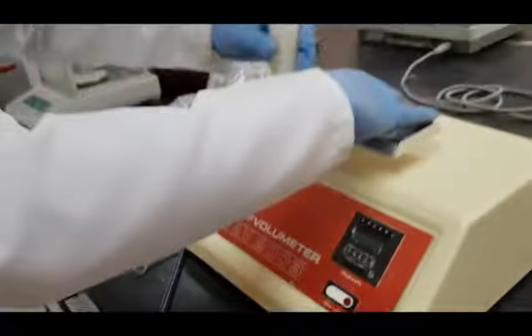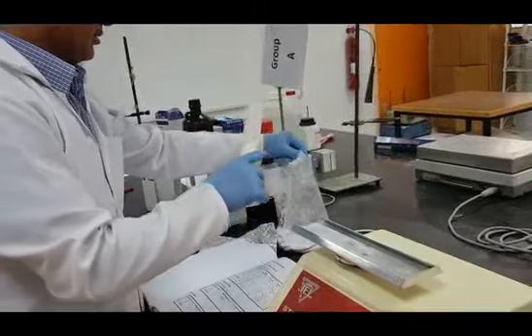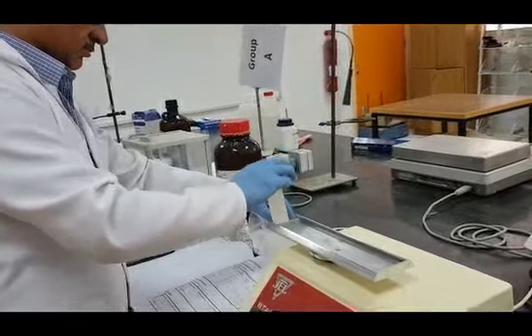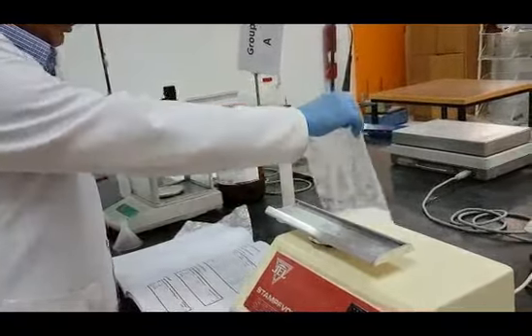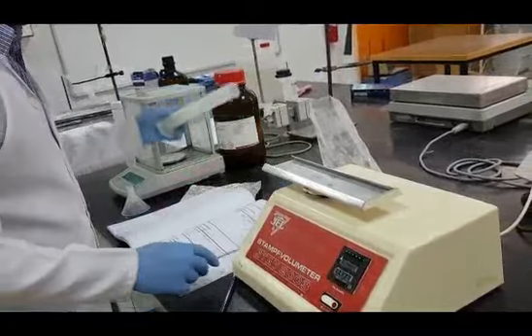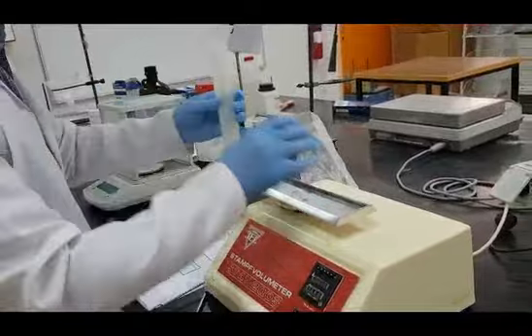Please, when attaching the measuring cylinder containing the particles to the tap density apparatus, transfer it with the minimum disturbance of the bed, because this will change the volume. Return the particles to their container or plastic bags.